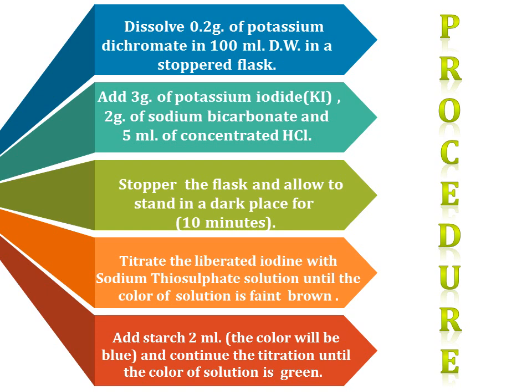Then allow to stand in a dark place for 10 minutes to prevent explosion because the reaction is vigorous, and also to give enough time for the iodine to be liberated and converted from water insoluble to water soluble.